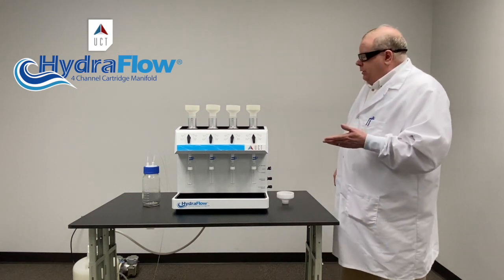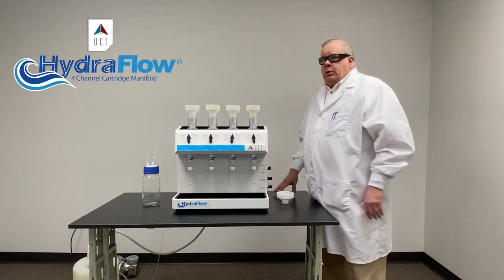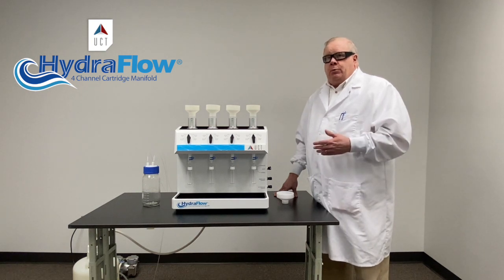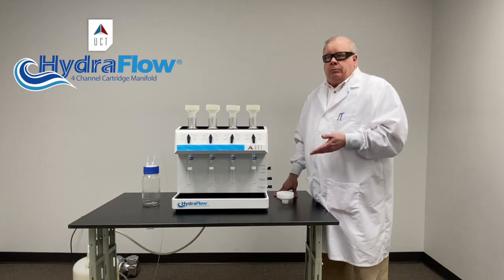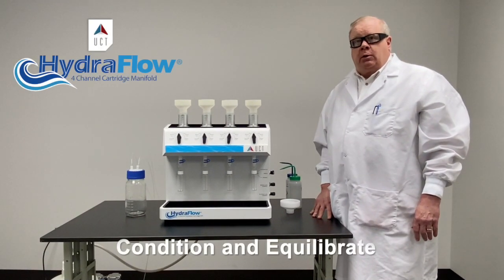The way this works is: first we're going to condition the cartridge like we normally would, then we're going to equilibrate the cartridge and then add the sample, dry using the vacuum, and elute. Then we use it just like we would a regular manifold.